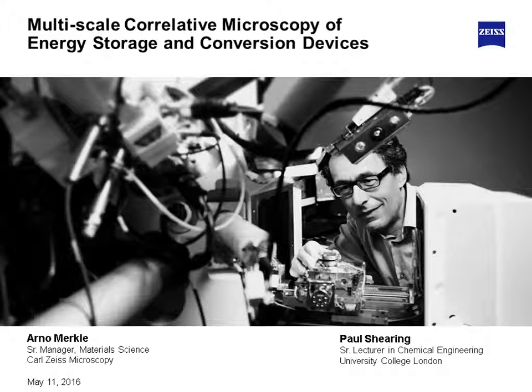So steps that have been taken, for instance, to create a sample for the ultra, which is typically much smaller, a few tens of microns, or even preparing all the way down to the focused ion beam, where you need to have basically a surface that's accessible. We've used a variety of techniques, including some laser ablation techniques, and some mechanical cutting techniques.